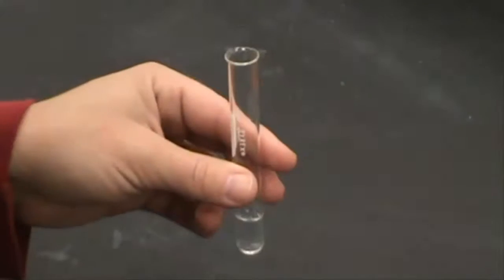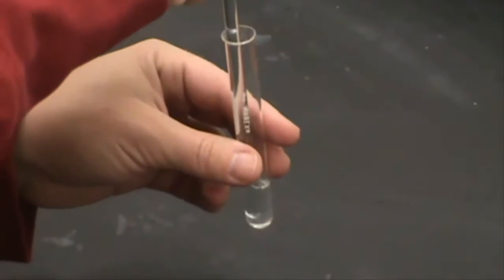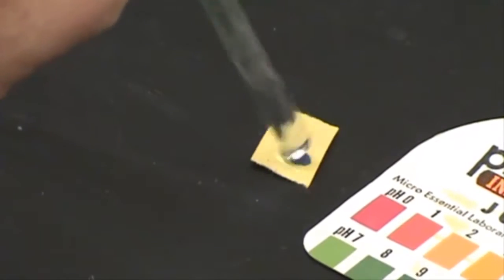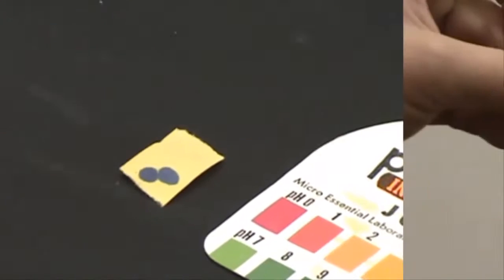Please review your text regarding buffers. You will be checking the pH of the solution you create. Take a drop of your solution using a glass stirring rod and touch it to a piece of pH paper. pH paper changes color depending on the pH.